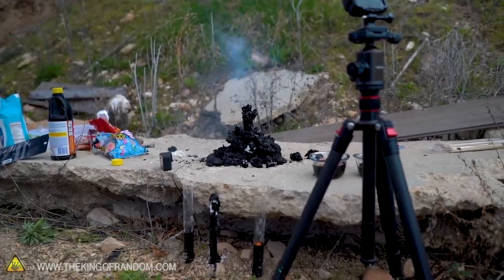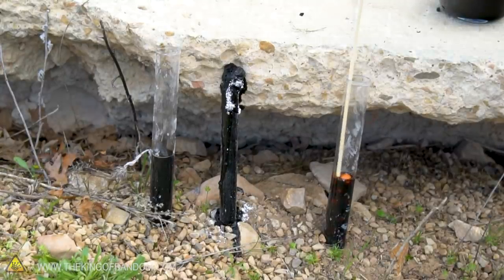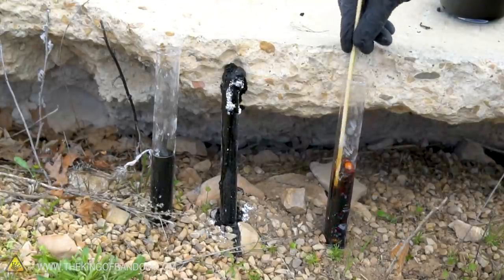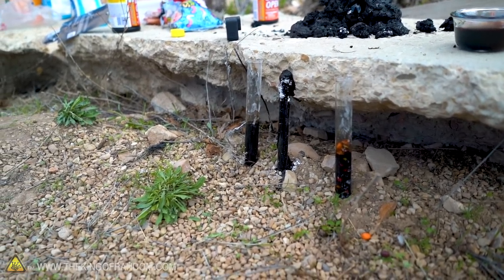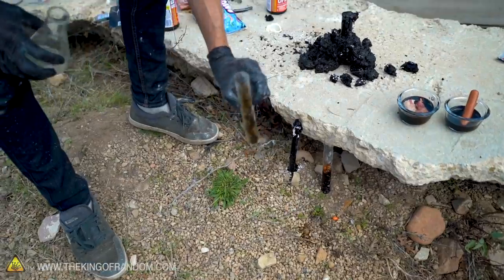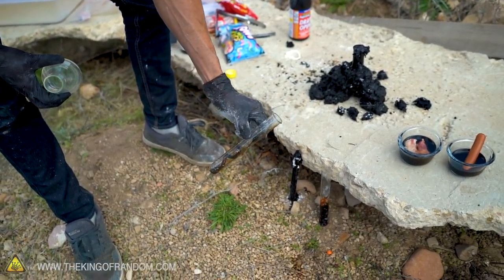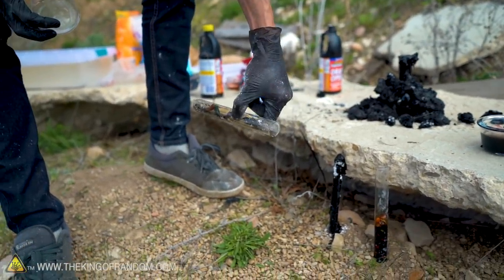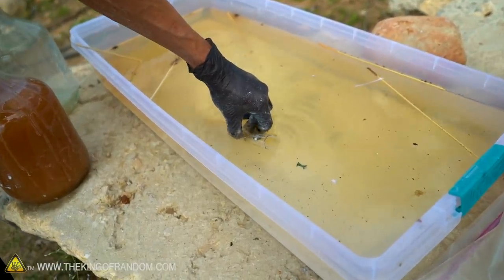That goes quick. Let's check in on our gummy worm and Skittles, which so far I haven't seen anything happening with — which really makes me think that surface area is key. We had a slight casualty: our gummy worms beaker tipped over. It seemed like there was almost no reaction, so we're just going to call that and neutralize it. We're going to let the Skittles keep running to see if anything changes there.